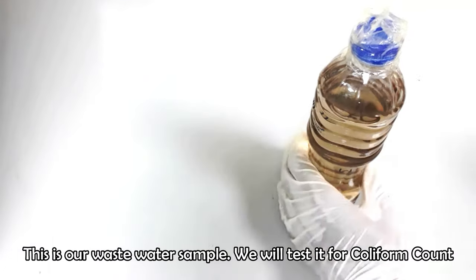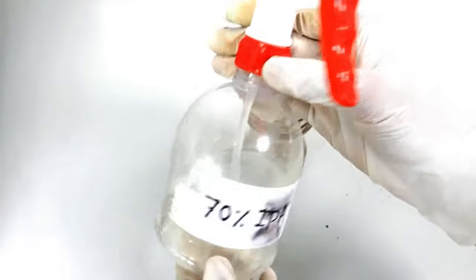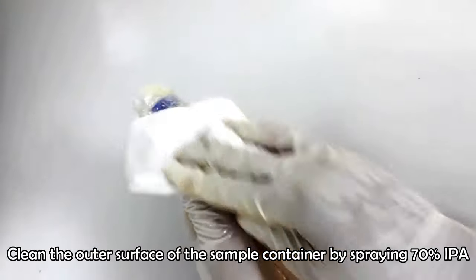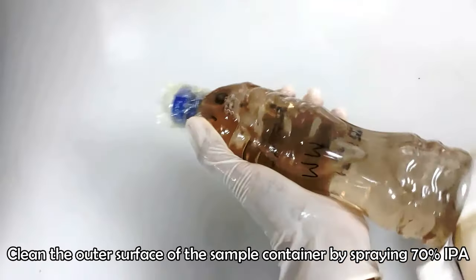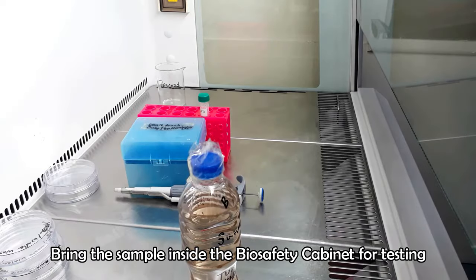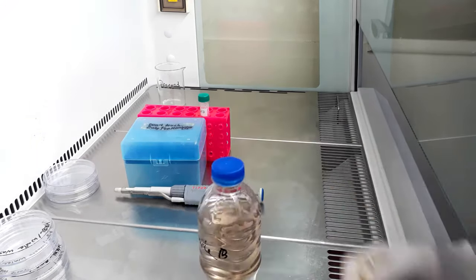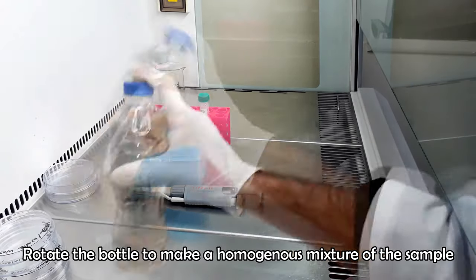The sample should be taken out from the storage condition and thawed at room temperature for 40 minutes. We will spray 70% IPA to remove contaminants from the sample container surface. Now we will bring the sample inside the biosafety cabinet. We should mix the sample properly before taking the sample for the test.